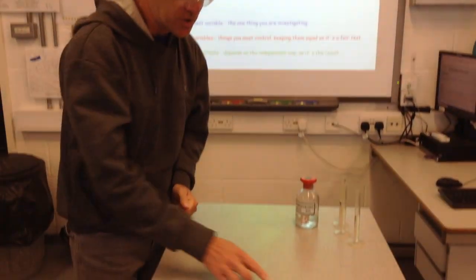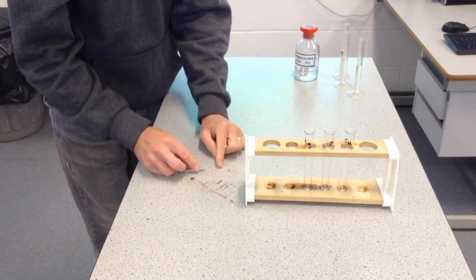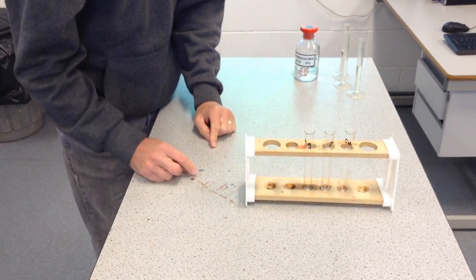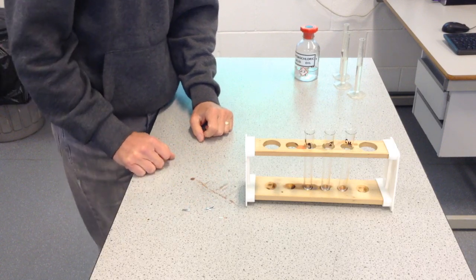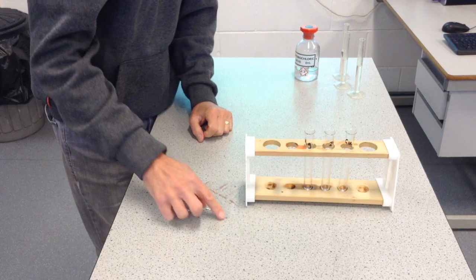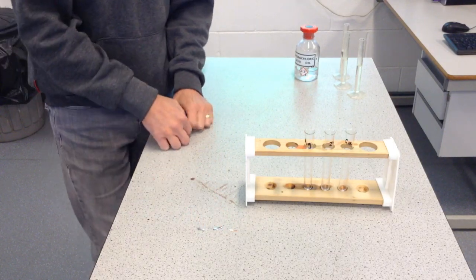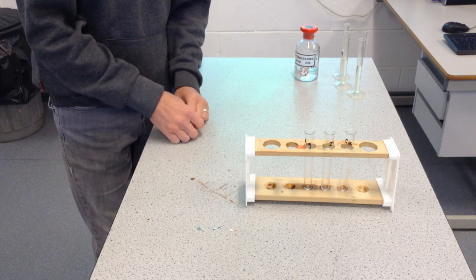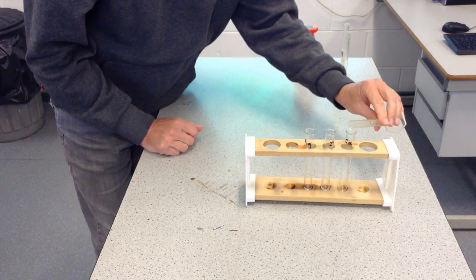Okay, so I'm going to put my goggles on for this experiment this morning, and what we've got is the type of metal. So we've got three today. We have copper, we have zinc and magnesium. Okay, so the first thing I've done to control it is to make sure I've got the same amount of metal. The second control variable is to try to make sure I've got the same volume of hydrochloric acid.